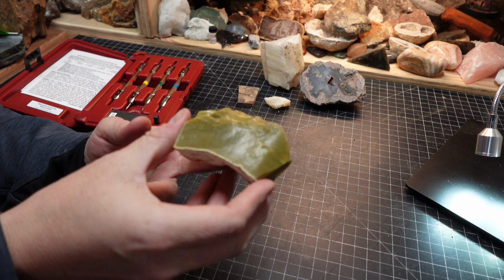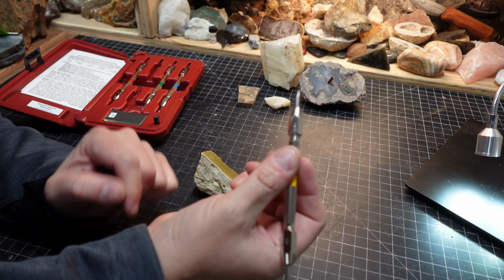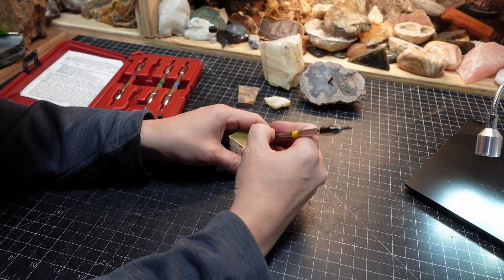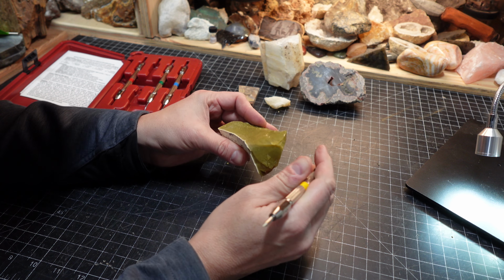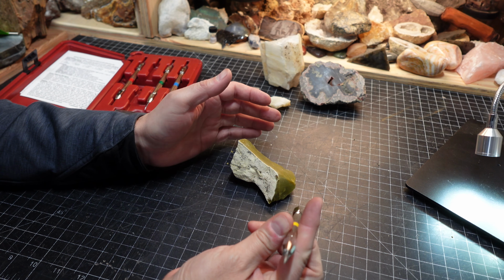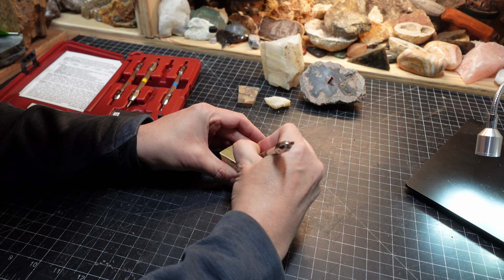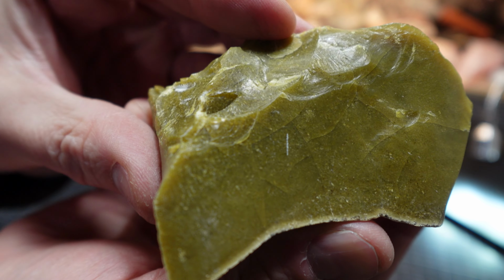Probably not. I'm gonna start with number 1 here, and I think we will start with a 4. I think 4 will probably be a good place to start, and you're going to hold it kind of like you're writing with a pen, at a 70-ish degree angle, and with moderate pressure, you are going to scrape and move up until you get something that you think might be a scrape. There's a 5. And, well, 6 definitely put a scrape in that. You can see that little line right there.